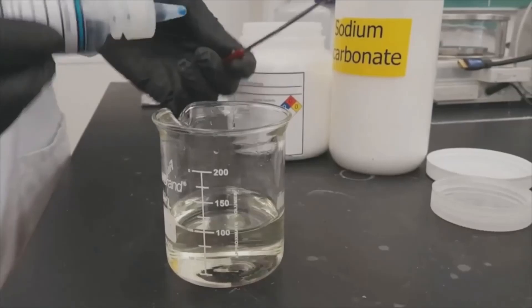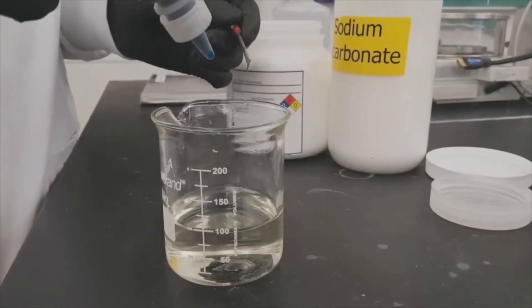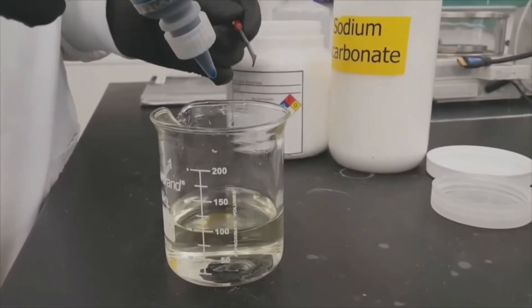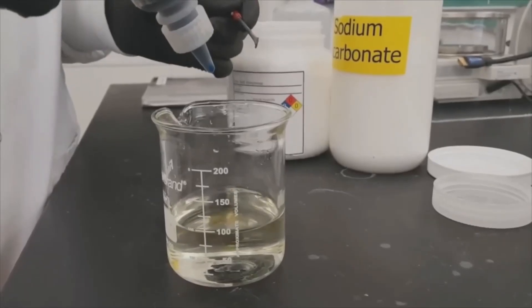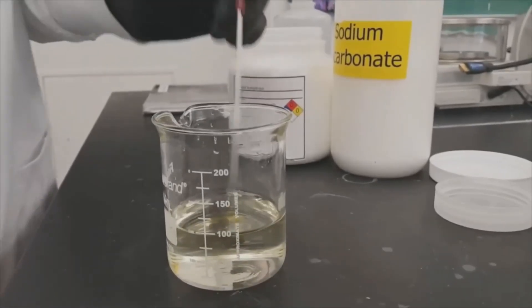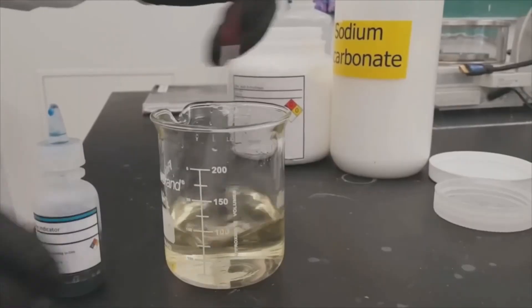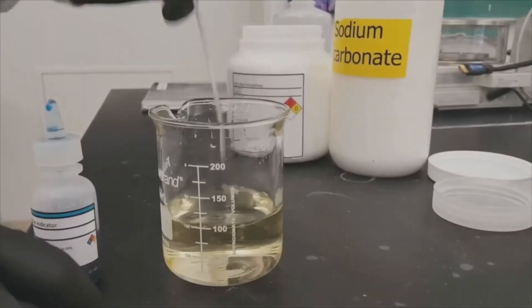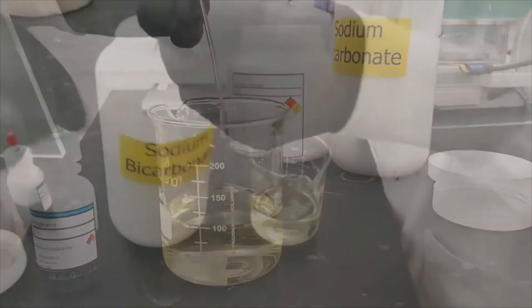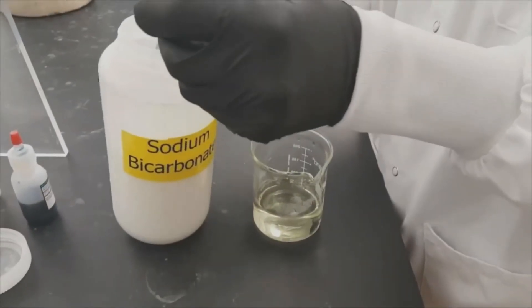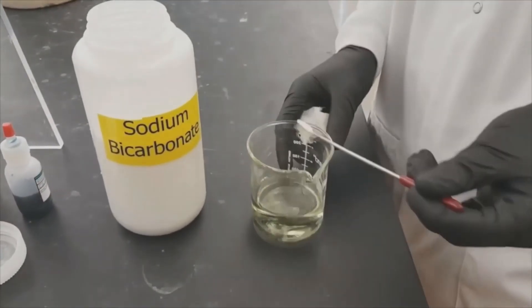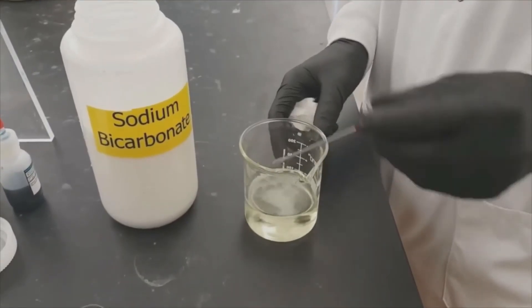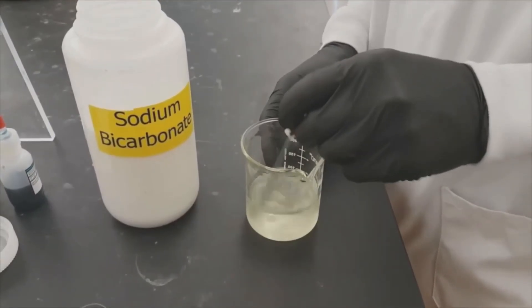Bromothymol blue will appear yellow if your solution is acidic and blue if your solution is basic. So if it's yellow, you'll want to neutralize the acid using sodium bicarbonate. It's very important when you do this that you add only a small amount of bicarbonate at a time. For example, one spatula tip full.